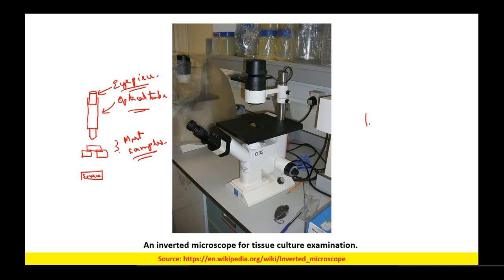However, if you want to image mammalian cells, say in a T25 flask, if you see what is happening over here, these flasks have their own thickness. Now, if you have to put the objective lens, it would need a very, very wide or higher working distance. You need an objective which has a very high working distance.